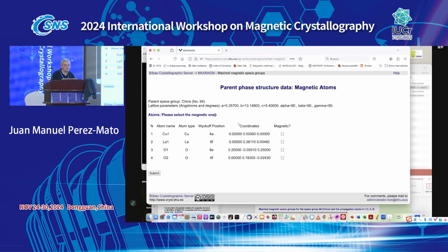You upload, and here is what we said. It is information, complete information of a magnetic structure or an ordinary structure. Asymmetric unit, unit cell, space group. And now we say copper is magnetic, okay? We submit.